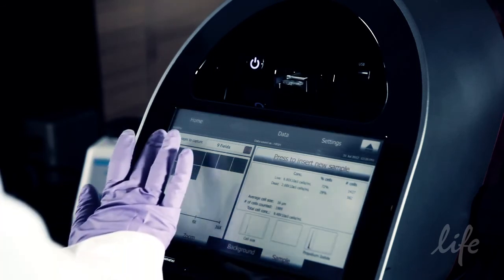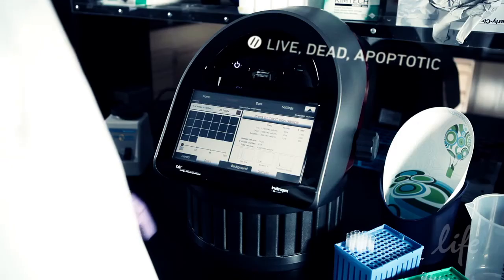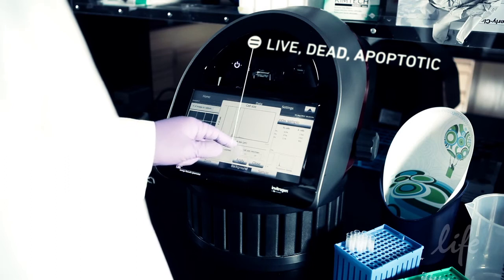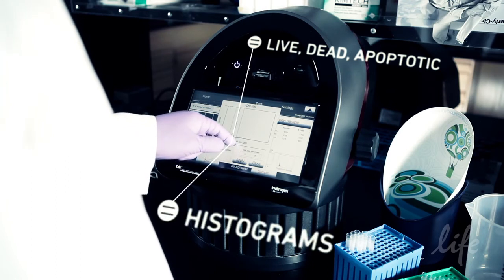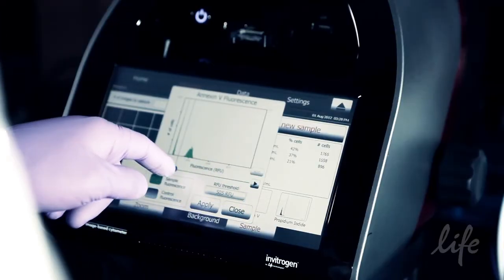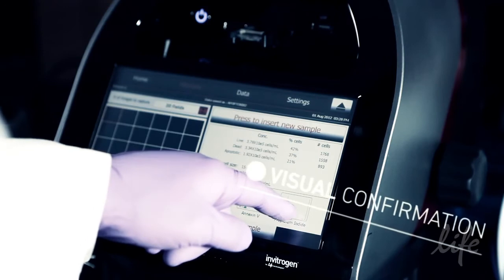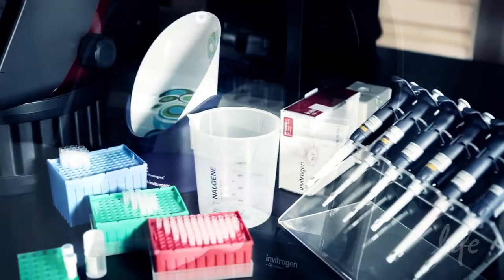The Tally apoptosis assay specific data includes the cell concentration and the number of live, dead, and apoptotic cells, as well as the histograms for cell size and fluorescence intensity for Annexin V and Propidium Iodide. Results can be visually confirmed by examining the images of the captured fields of view.